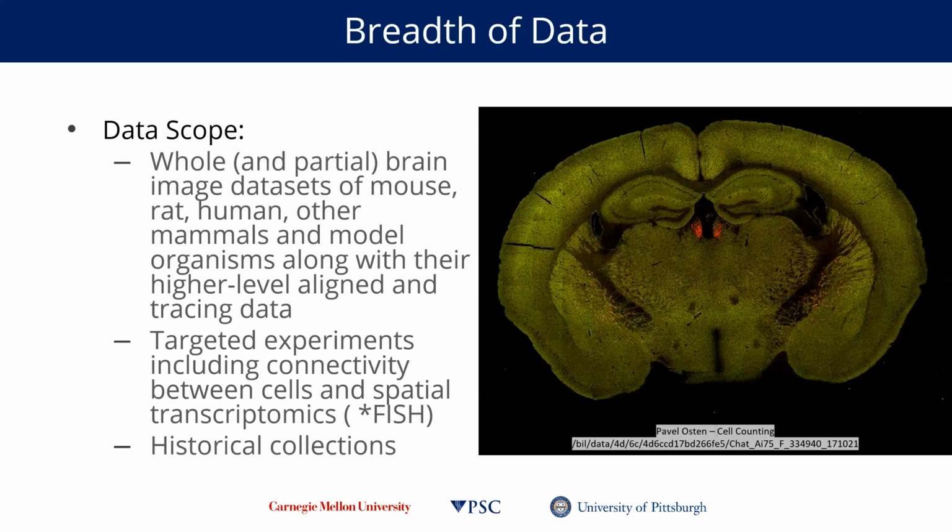Some of the largest, highest resolution mouse data sets that we currently have at BIL are generated using the fMOST technology. These fMOST data sets range from about 8 to 13 terabytes each and contain about 10 to 15,000 slices per data set. The resolution of each individual slice is about 35,000 pixels by about 55,000 pixels with a Z spacing of about 1 micron.